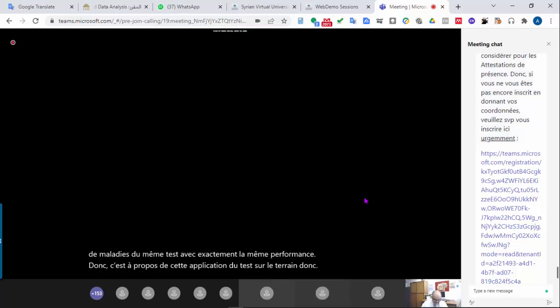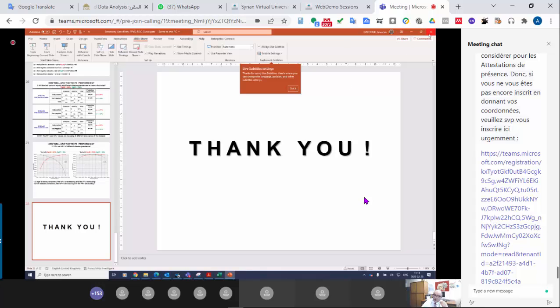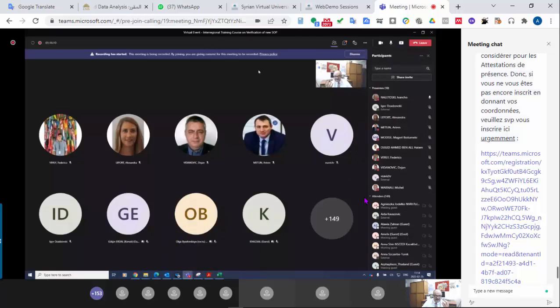So I can share this presentation with you. This is just for your information and consideration that even if we get perfect results in the field, there will be sources of uncertainty in the results, especially when we convert the result from the spectrophotometer to the status of the animals. This is sick and this is not sick. We still have considerations on the uncertainty of the test because of its performance.